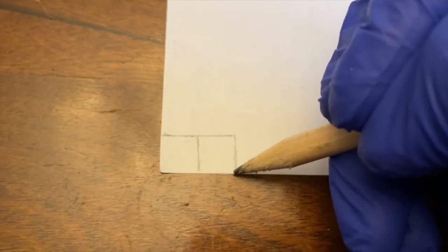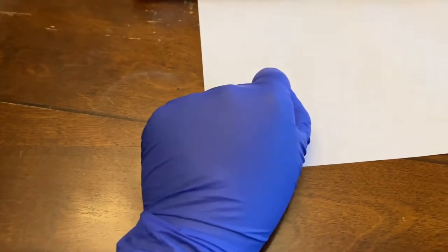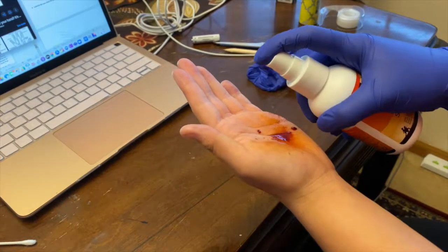The bond paper for this simple experiment has been pre-ruled in centimeter square. Put on disposable gloves and cut along the lines to obtain the required squares. You will need two squares of bond paper, each one centimeter by one centimeter, adhesive tape, a betadine swab, and a cotton tip swab.